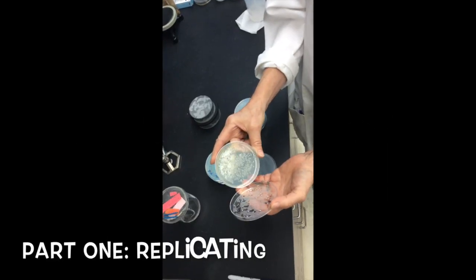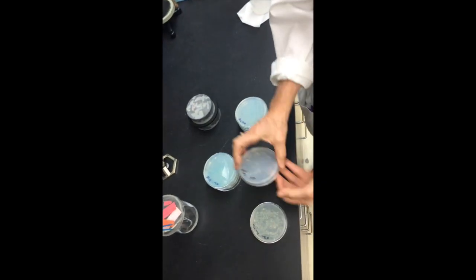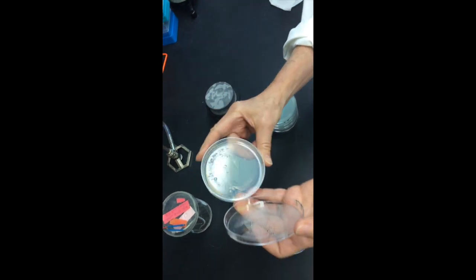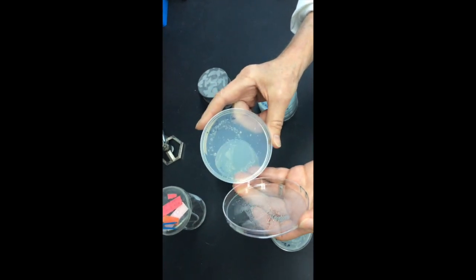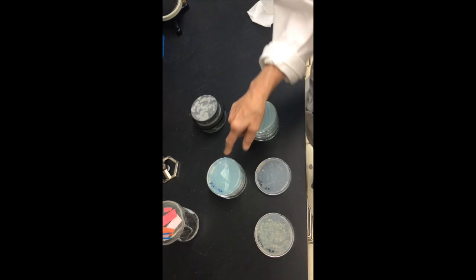We have a number of colonies on sample number 2 from one manure area. We have a different spectrum of colonies on sample number 4, not quite so many, but we see that some of them are a little bit different, a little bit yellow. Now we're going to replica plate.